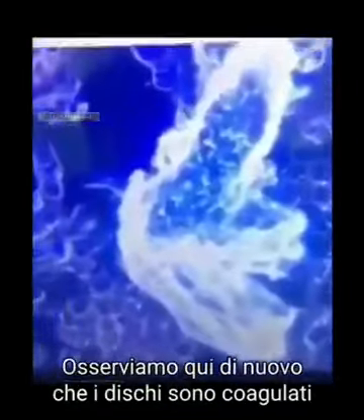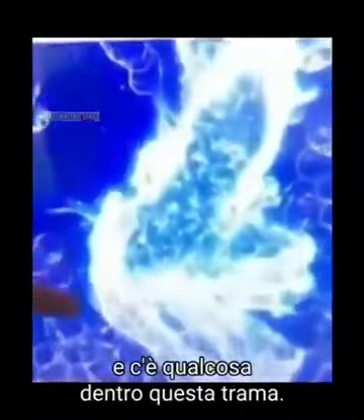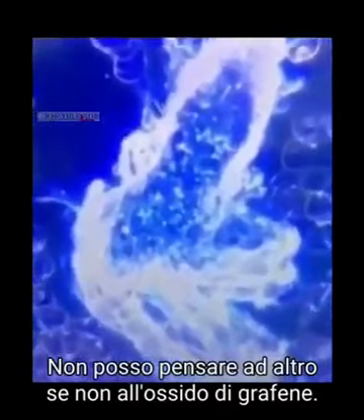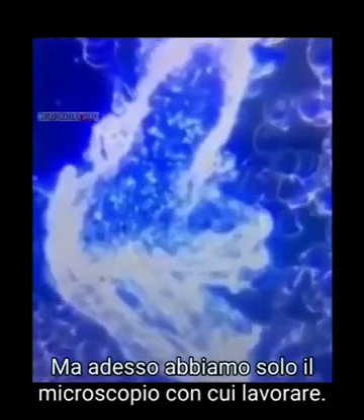So let's look at the next one and try to get through this. What are we looking at here? Here again, the blood cells are coagulated, and also again there is something in the blood. It has again these things here on the side. So very similar. I can only think that it must be graphene oxide. Must be graphene. Well, Dr. Young has unequivocally proved that it was graphene. It is graphene in the blood. But we've only got microscopy to work with right now.